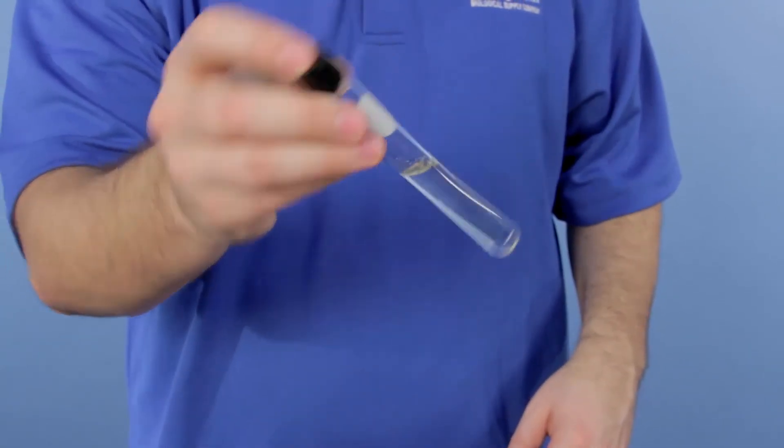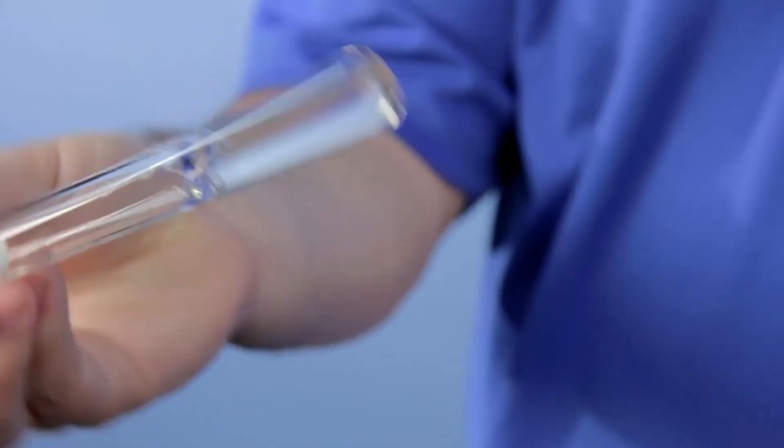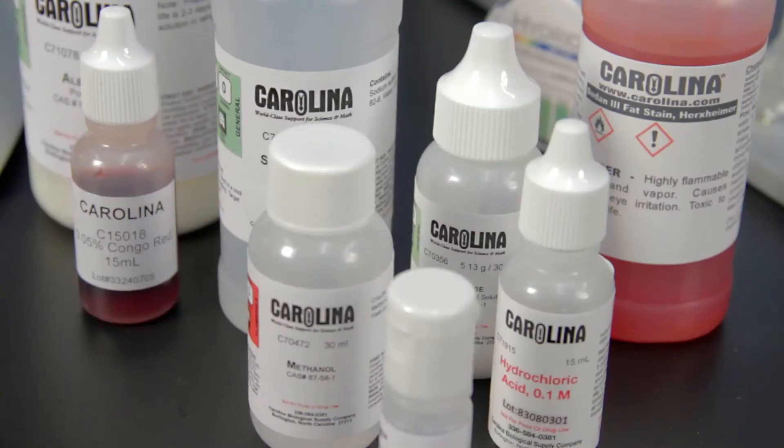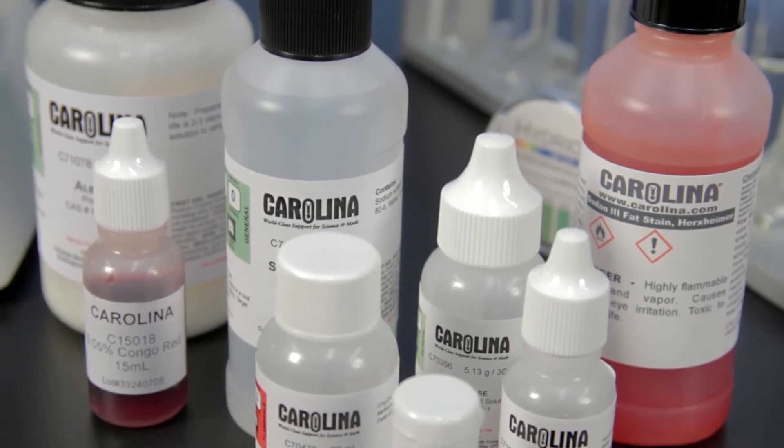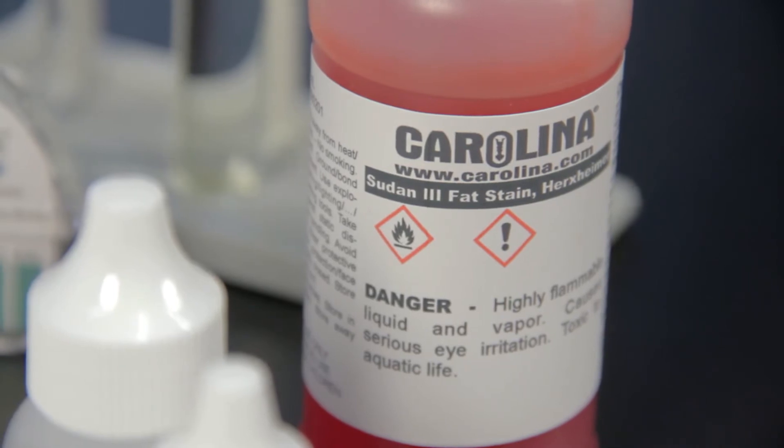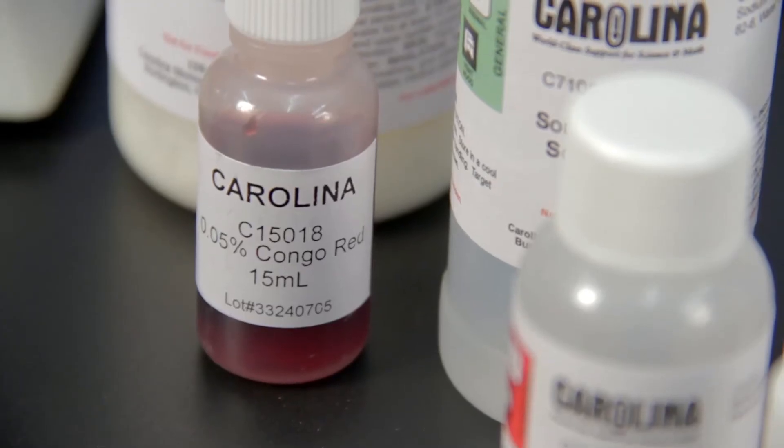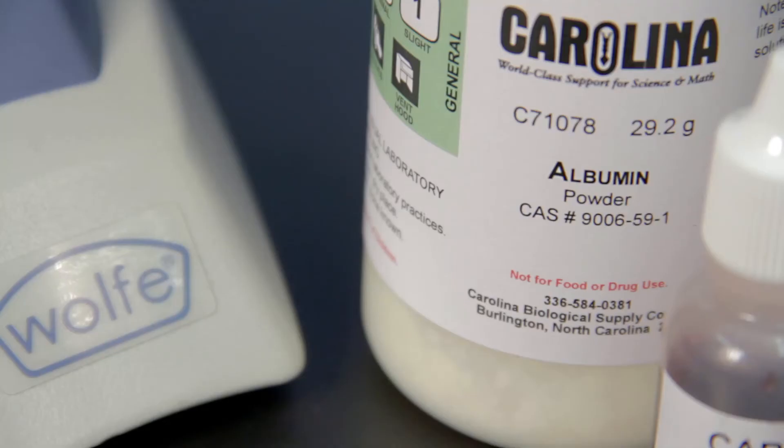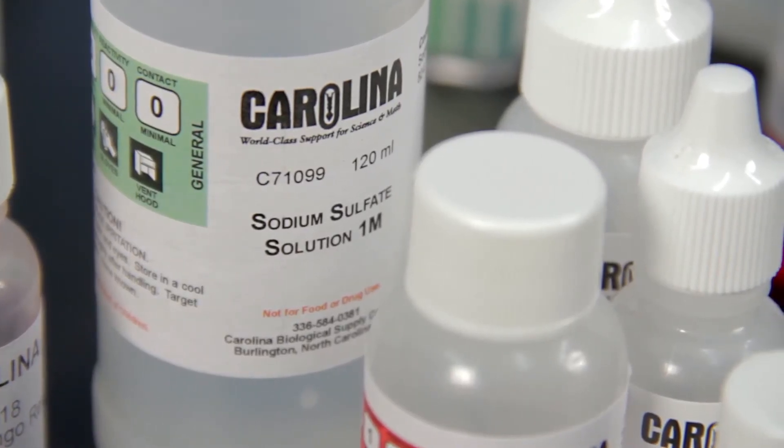In the inquiry investigations, students begin further examining the lifelike properties of these coacervates and experimenting with various environmental factors. Whether they decide to test the impact of pH, different protein or carbohydrate solutions, permeability to stains, temperature, salinity, or a variety of concentrations, students are sure to make big picture connections between multiple big ideas.